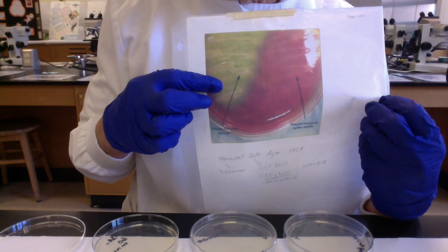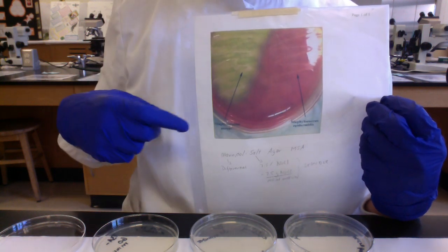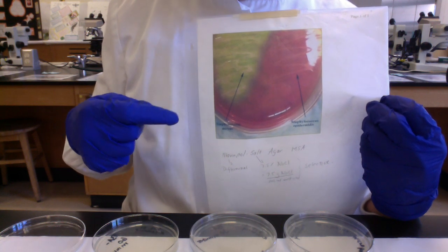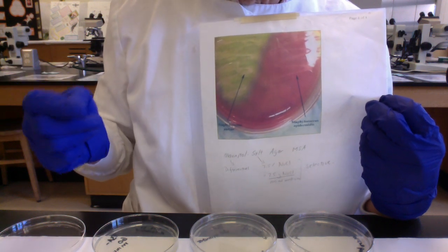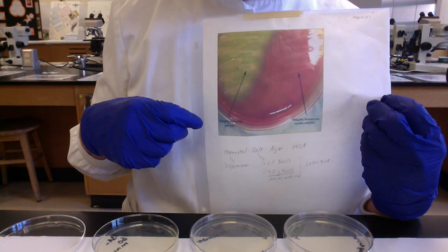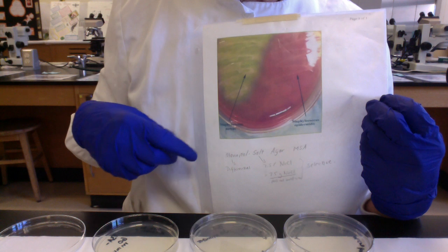If the microbe can't ferment mannitol, they'll have to start tearing apart proteins and amino acids as a source of carbon and energy. When they rip apart the amino acids, they release the amino group as ammonia, and that's a weak base. So the pH is going to go up, and phenol red at alkaline pH is going to turn a red color. Sometimes they call it fuchsia.